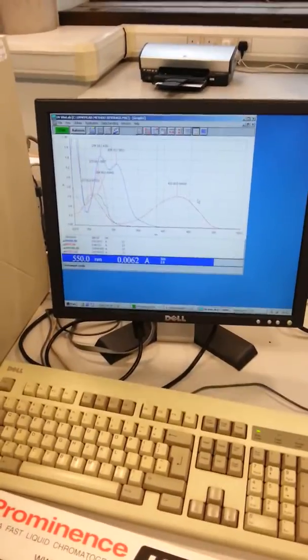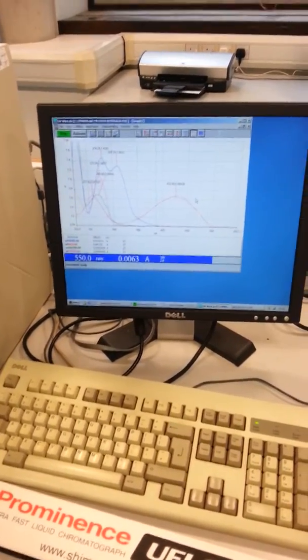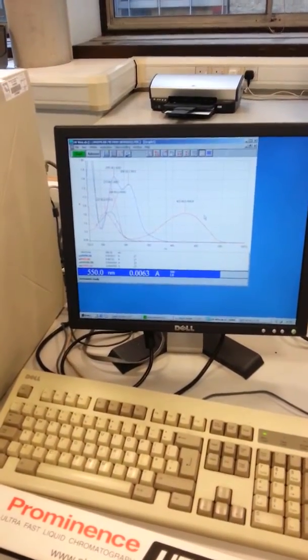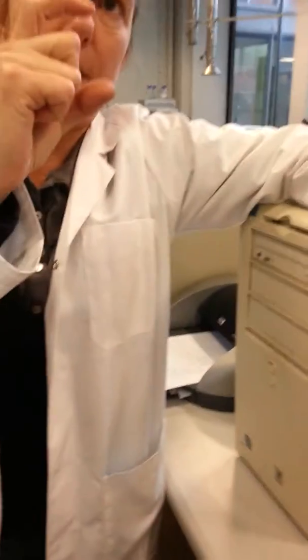Right, now, you've got to pick one wavelength and only one to program into the detector next week, for all 4 compounds. Because what happens is you'll make up mixtures, just quantitative standard mixtures that have all 4 compounds in the same volumetric flask.